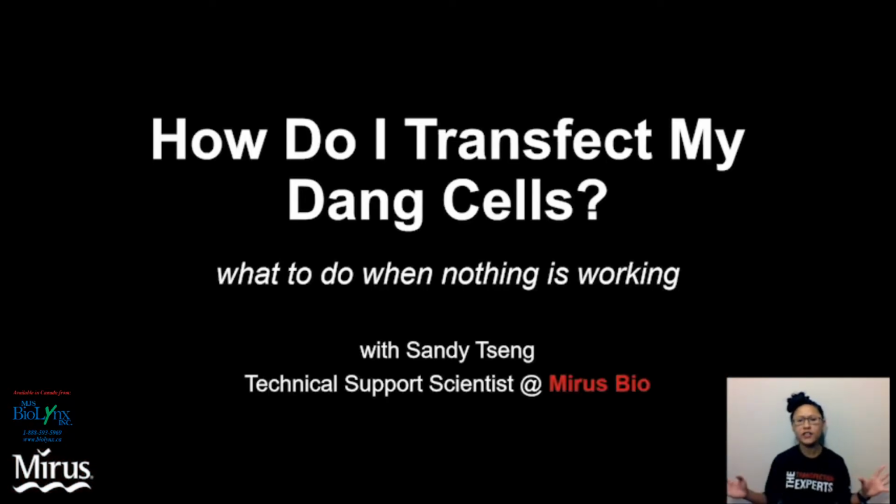And okay, that's all fine and well, but the title of this talk is How Do I Transfect My Dang Cells, and what to do when it doesn't work. So in the next part of this talk, let's go over how it's done in the lab, practically speaking.